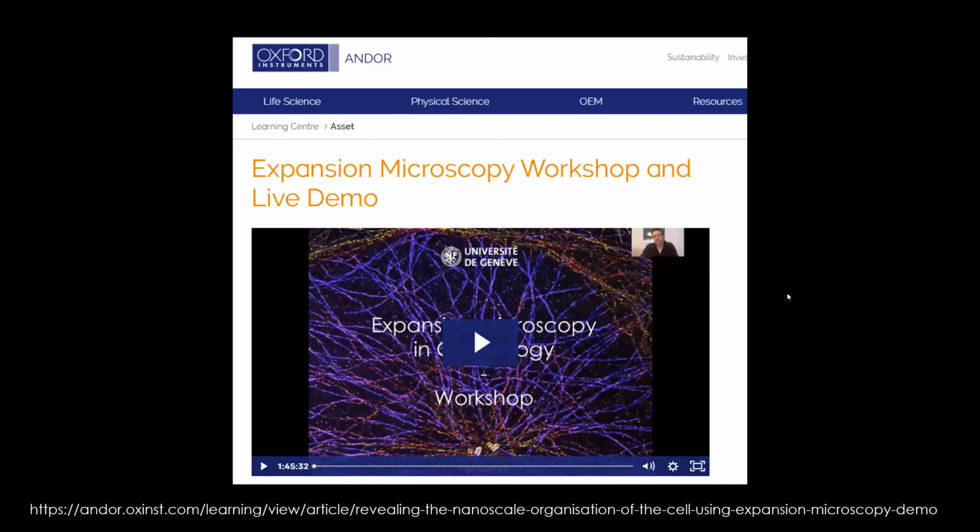Another technique is this expansion method. The ultrastructural expansion is also discussed in this really nice workshop given by Andor. You can find it online, and it also appears in the group's document.